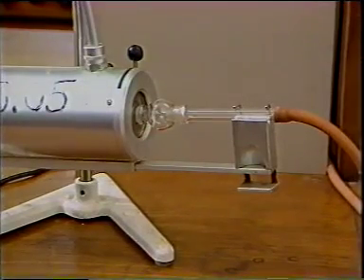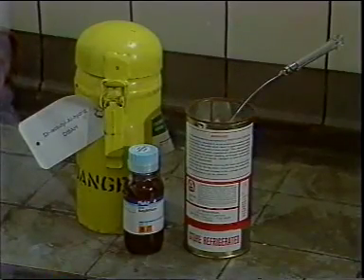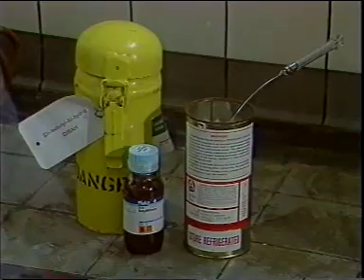Another major change in synthetic organic chemistry over the last 30 years is the development of more and more specific reagents. Unfortunately, many of these are very sensitive to air and moisture in the atmosphere, like the ones I have here. Fortunately, it is only the reagents and some intermediates that show this sensitivity. Normally, the products of the reaction can be worked up in the usual way.